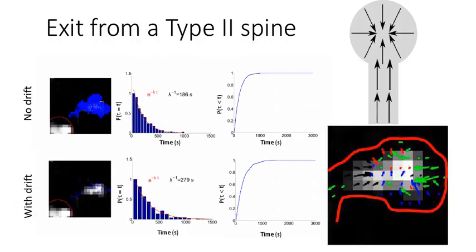And this is an example where the field is in the opposite direction. So instead of decreasing the time, it increases the time. But again, the overall statistics is Poissonian. And I'll finish here this video about numerical simulation at the super resolution limit. And I think this is a great tool that can be used each time you have super resolution data, and you are interested in estimating statistics that are not contained in the data. Thus, you do the simulation.